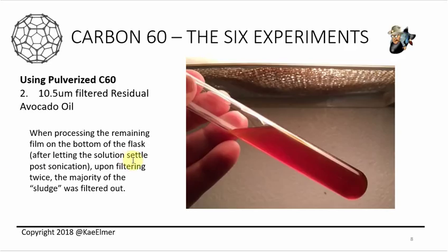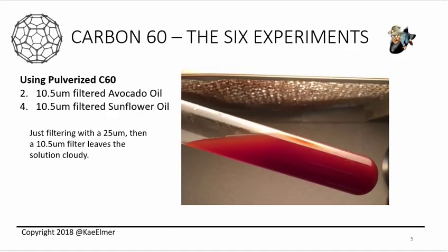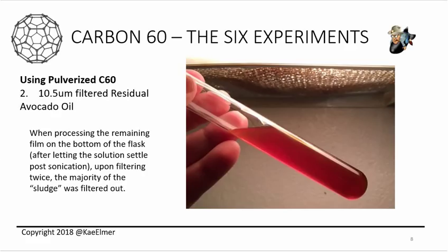And then after 2 filters, just treating it like a fresh batch, I was trying to see if I could reclaim the residual C60 on the bottom of the flask. This is what it turned out. It came out this real weird orange color after I filtered it the 2 times. I didn't filter it the 3rd time because when I was looking at this, it just wasn't coming out right, because this is what a normal batch would look like. This was me trying to reclaim a residual batch.